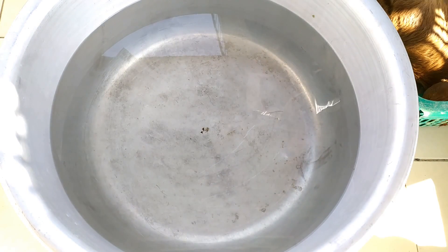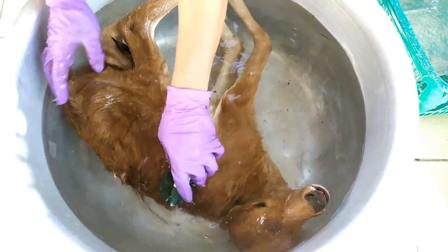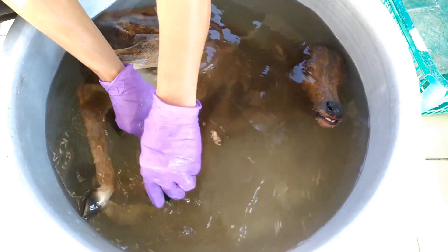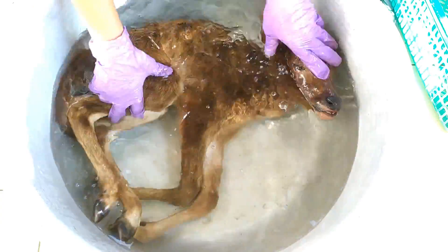In the first step, the specimen may be rinsed thoroughly with clean tap water and the body surface gently brushed to remove dirt and other superficial impurities. A second or even a third rinse may follow as required.